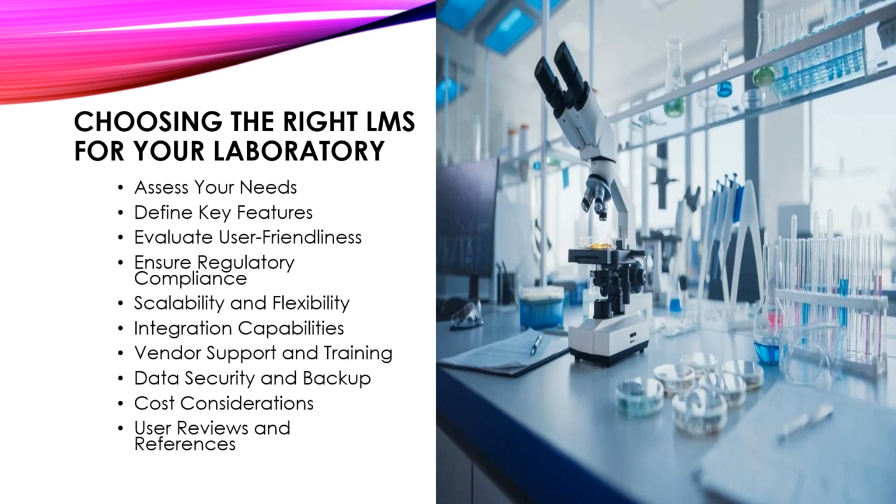The first is assess your needs. Before you start looking at different laboratory management system options, it is essential to understand your laboratory's specific requirements. Now consider factors such as the size of your lab, types of tests conducted, regulatory compliance needs, integration requirements with existing systems, and budget constraints.